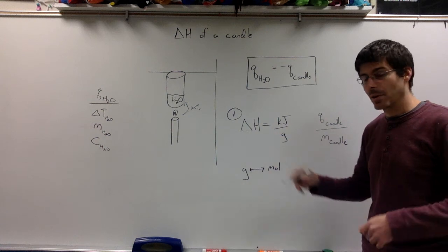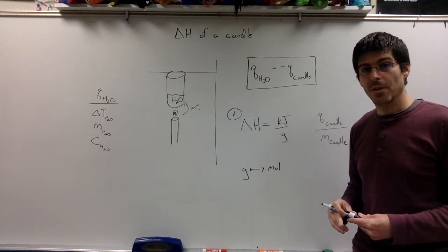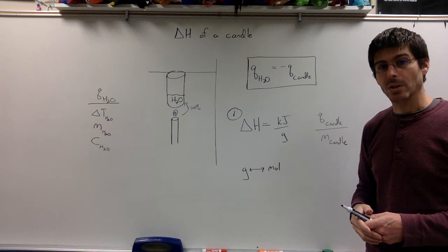There's a lot of lab data, though, that's useful in per gram. And then we will do another lab to look at another use of this water data that's not enthalpies. And you kind of have to decide when to use which one.